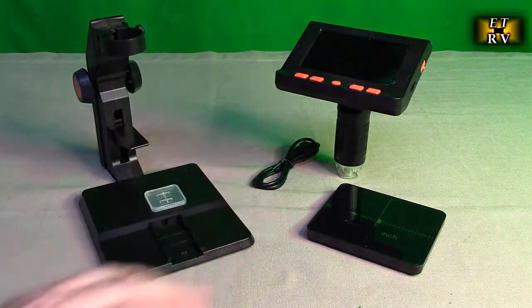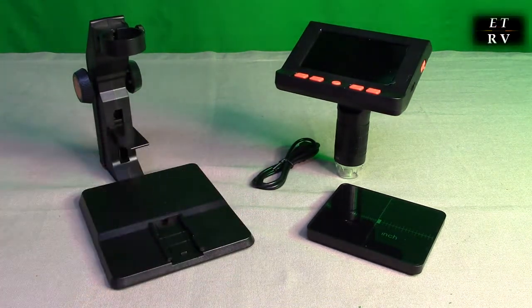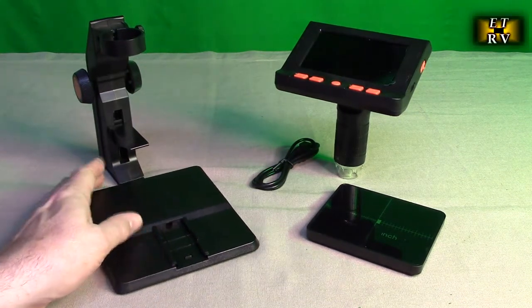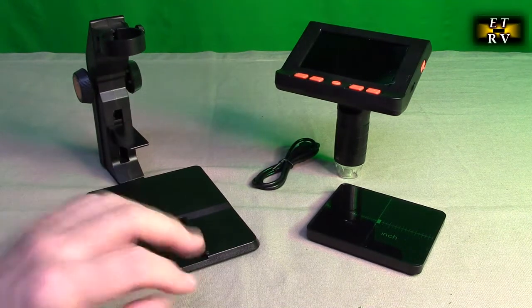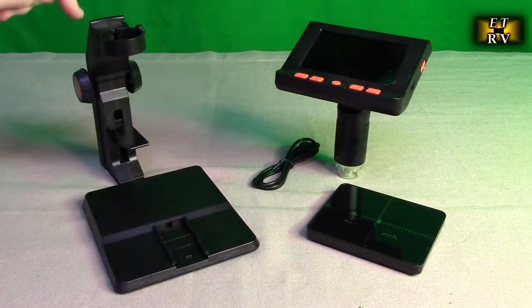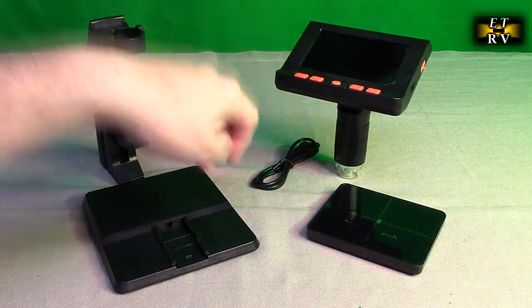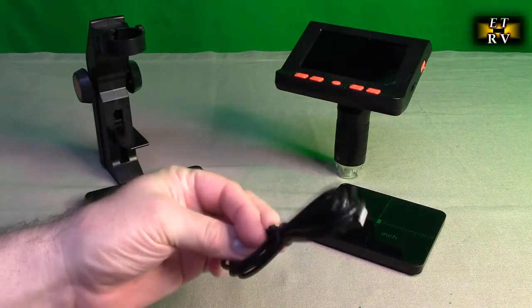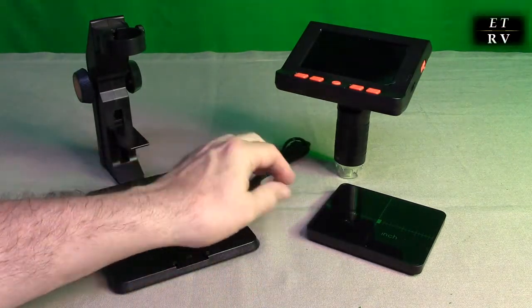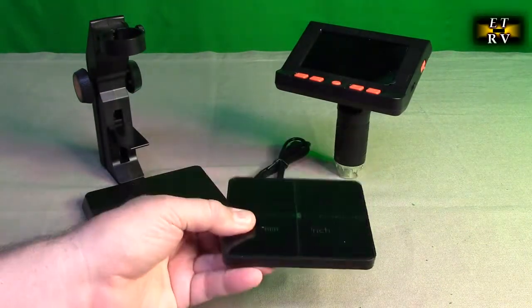Now this is what it comes with. There is a 32 gigabyte TF card that I already installed on the unit. The first thing you want to do is install and format that. Here is the base, here is the part that holds the main unit and allows you to go up and down, here's the main unit, here is a charging USB-A to micro USB cable, and here is the piece that goes up and down — it's got millimeters and inches on it.